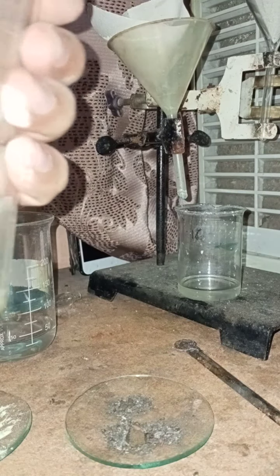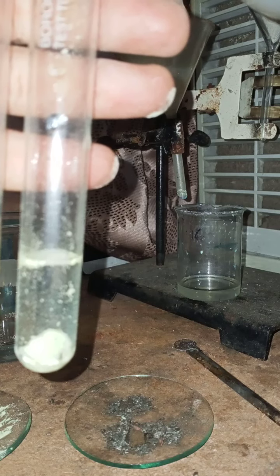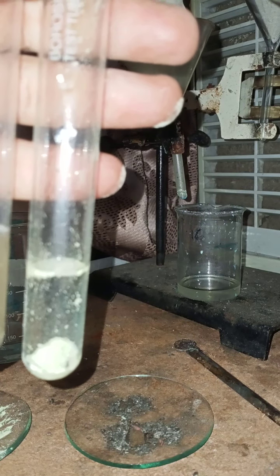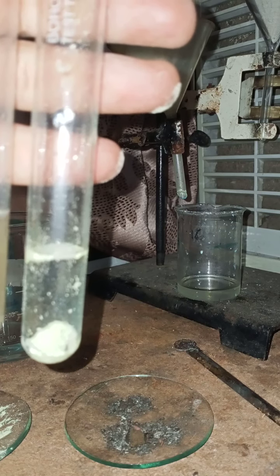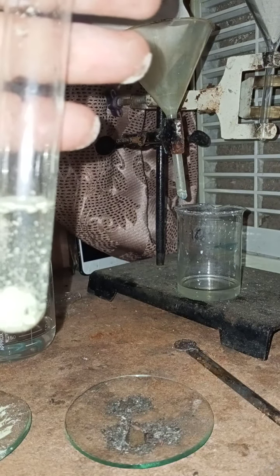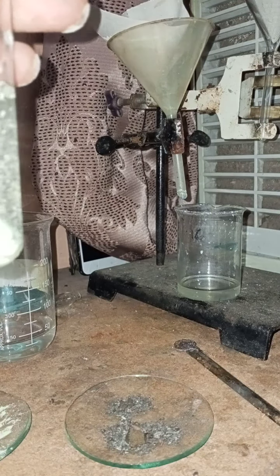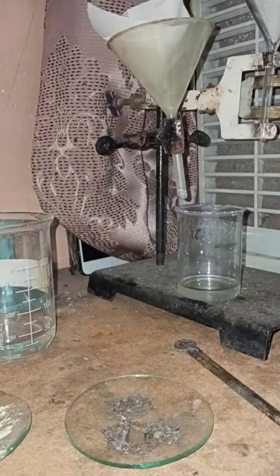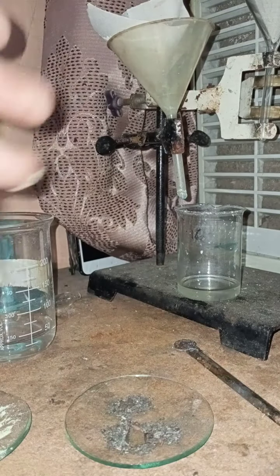See, in this test tube some reaction has started and gas is formed. So in both these test tubes you can see that the reaction takes place in a different manner.